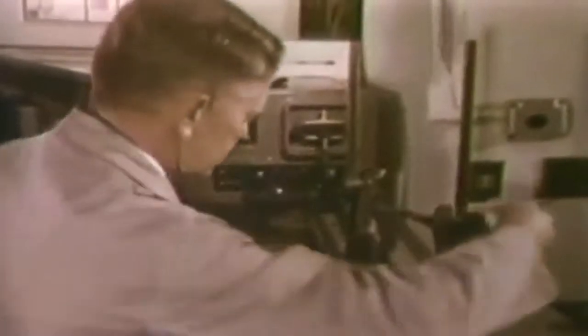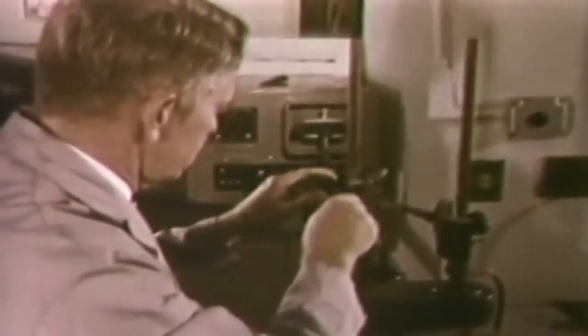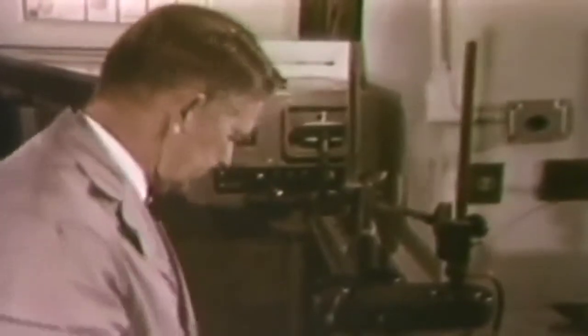Tiny flakes from known and questioned paint samples mounted in the well of a carbon electrode will be burned in a direct current arc. Elements present will emit light and produce their characteristic spectrum, which will be recorded on the photographic plate as a series of vertical lines of varying density.